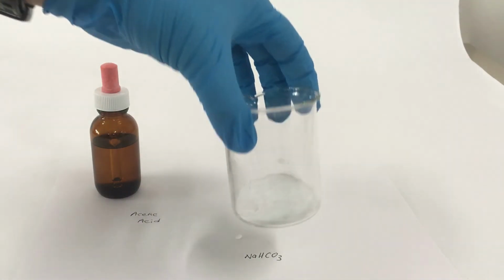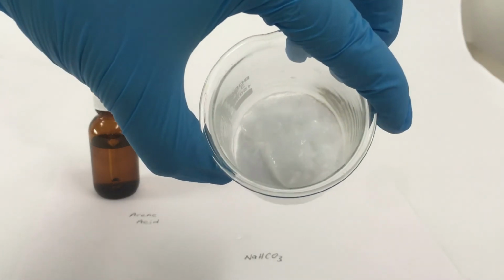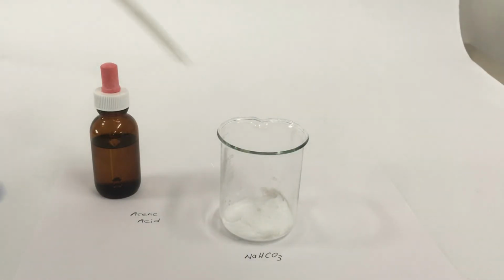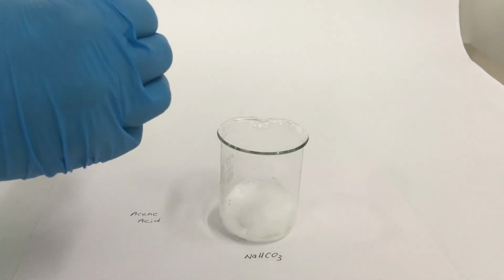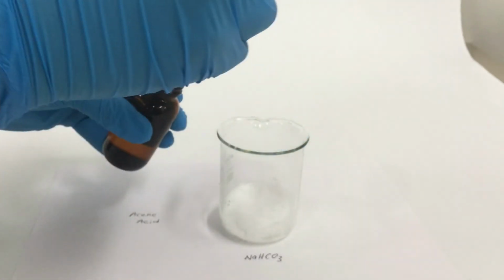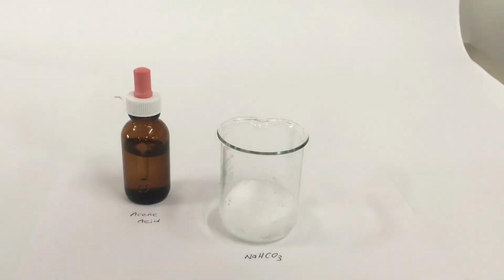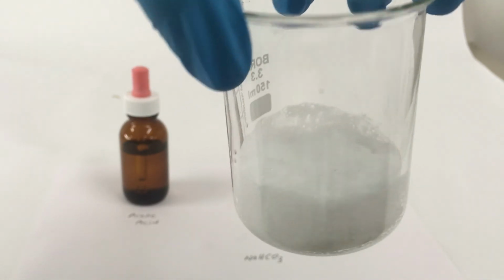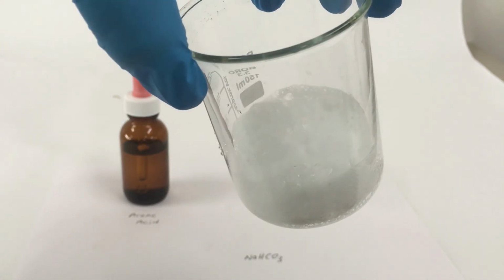Yeah, we can see the bubbling. You can hear that as well. As we add more water, we can actually get it to react. Bubbling. There's definitely gas being produced.